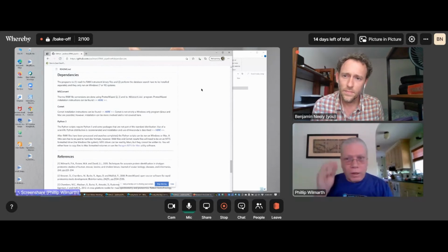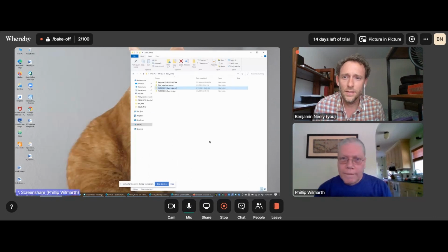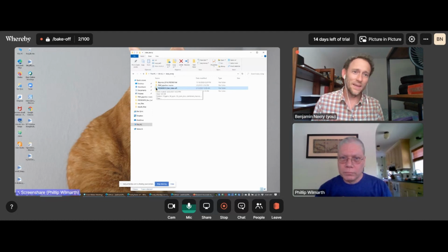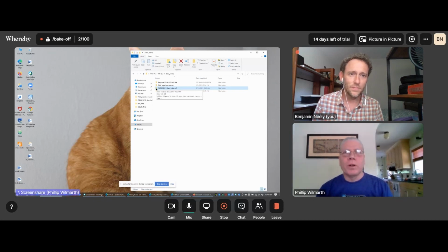Okay, so I think at this point I'll start playing with some actual data. And just because I have this proverbial person in my mind who is convinced that things don't work. I mean, these are pretty standard: MS Convert, it's going to stick it in a folder within ProteoWizard, Comet, these are just things that we're then going to point back at, right? So it's nothing fancy going on here. Right. Okay. Comet comes down like my pipeline as just a zip folder that you open up, and it's got an executable file in it. So there's nothing that it installs in a particular place.